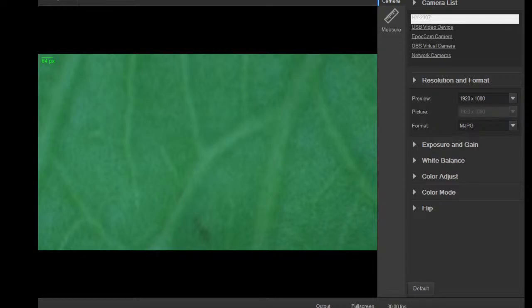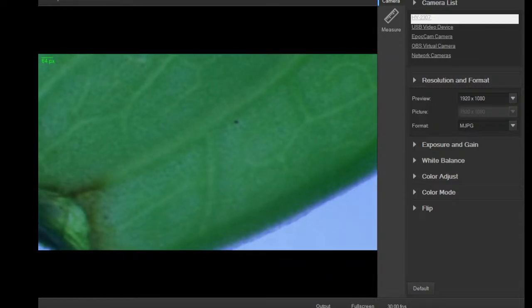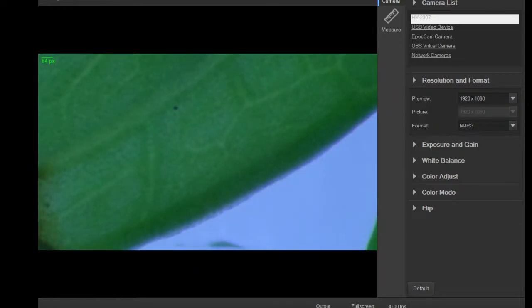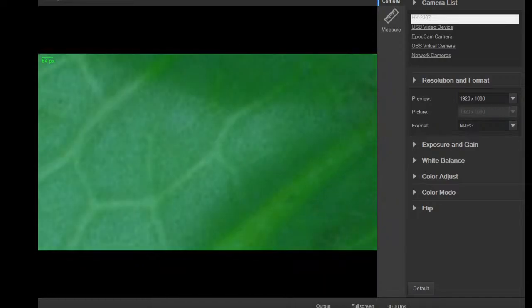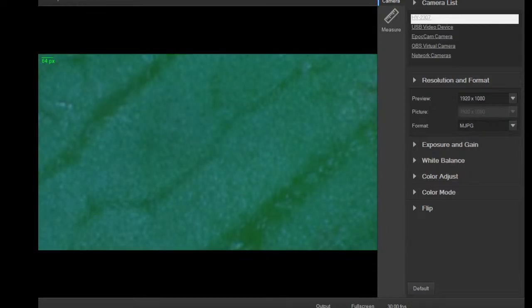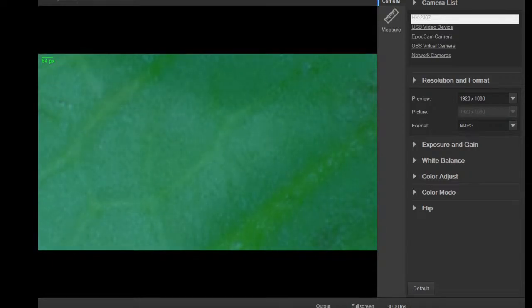Hey, Dave. Yeah, it's a leaf. This is a leaf from a celery stalk, the part that no one ever eats off the celery. And I was trying to show the cells of the leaf on the other scope, but the nature of a compound scope, where it's transmission light through the thing, the leaf was too thick to allow me to zoom in too close on one of the objectives, so I decided to try it on the dissecting scope and see what it looks like. Nice little venation pattern there. And I have the backlight on too, so you can see. That's full backlight there.